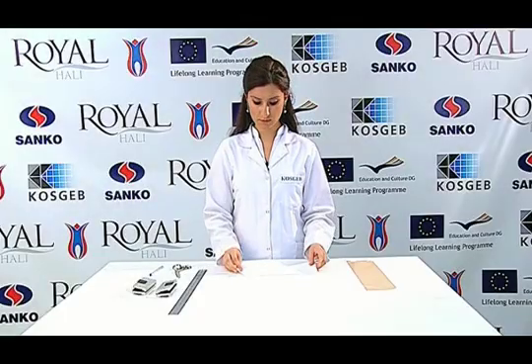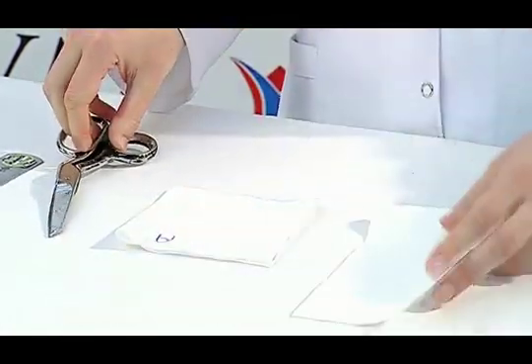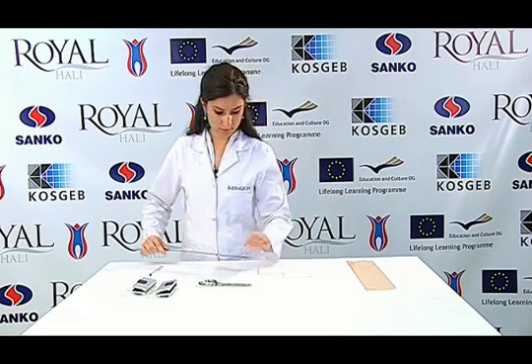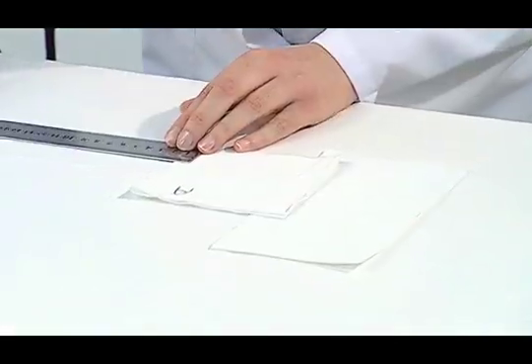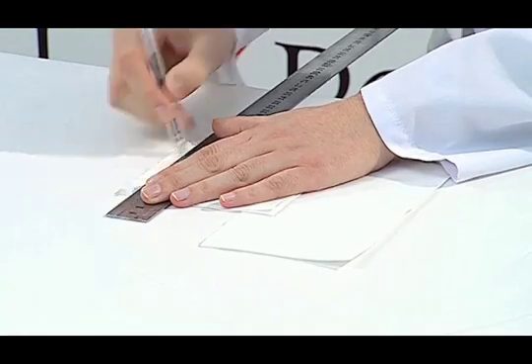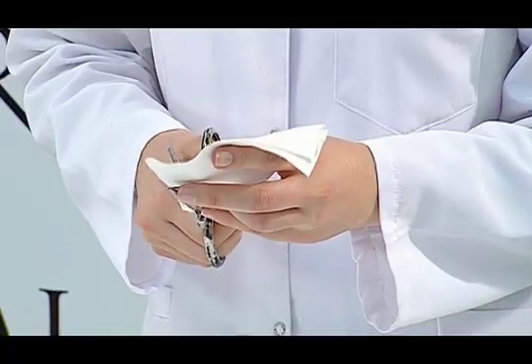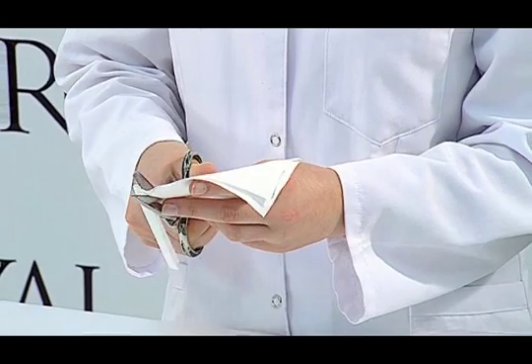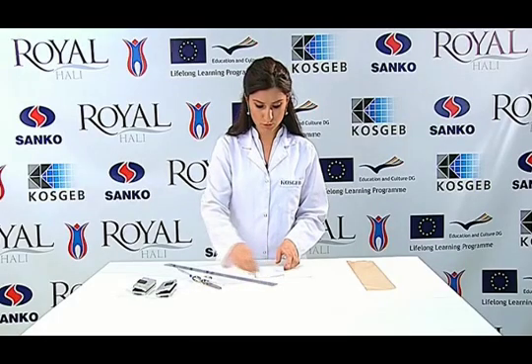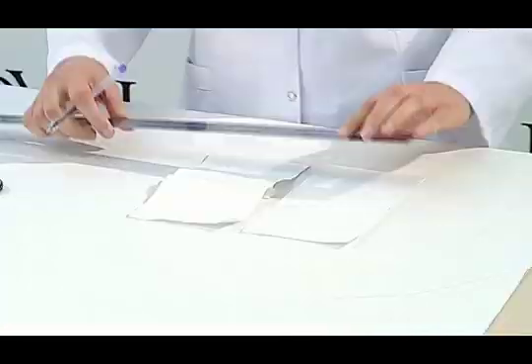The sewn test sample is cut with scissors into two equal parts, and thus two separate samples are obtained. One of these samples is without stitches and the other one is stitched. Then, 12 mm from the selvage of the stitched sample is marked and a line is drawn parallel to the stitch. Using scissors, two layers of the fabric are cut at this line, and a stitched and a non-stitched sample is obtained. Then, grid lines are drawn parallel to the long side at a distance of 38 mm in a way that it is parallel to the jaws of the device.